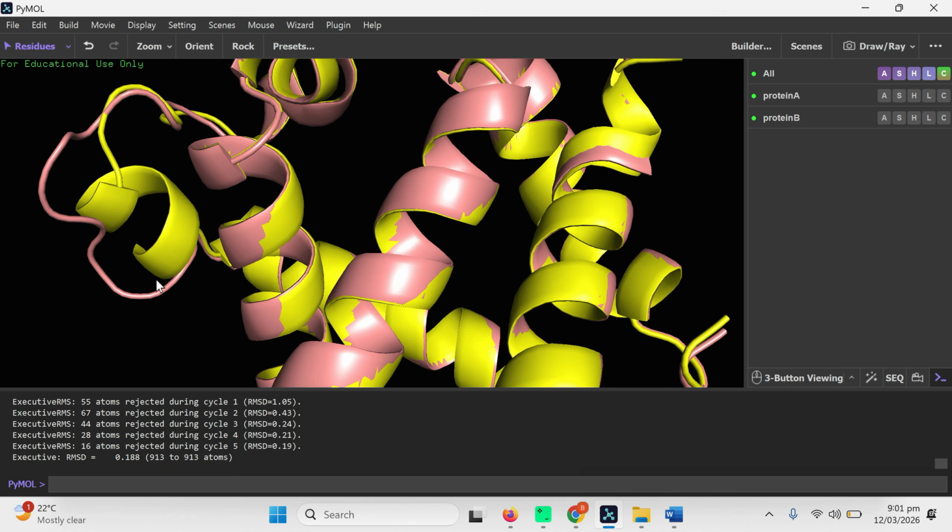Which means you have a native, unaltered protein, and you dock it with your ligand and see the result. And then you take its altered form and dock it again, and you will see what is the difference between the native protein and the mutated protein. This kind of project students can do. These mutation studies can also be used in rational design mutation to improve stability or function of the protein.